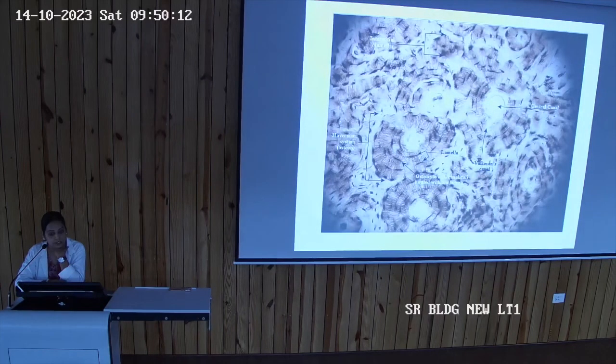This is unstained slide. Now these laminae are of three types. There is a Haversian lamellae which is concentrically arranged here. Now in between the adjacent Haversian lamellae, it has interstitial lamellae. Yes, there is Volkmann's canal, but these laminae do not only appear in one particular pattern. In दो Haversian system के बीच में भी lamellar arrangement होगा which is known as interstitial lamellae. And जो circumference periosteum के पास में arrange होंगी, they are known as circumferential lamellae.